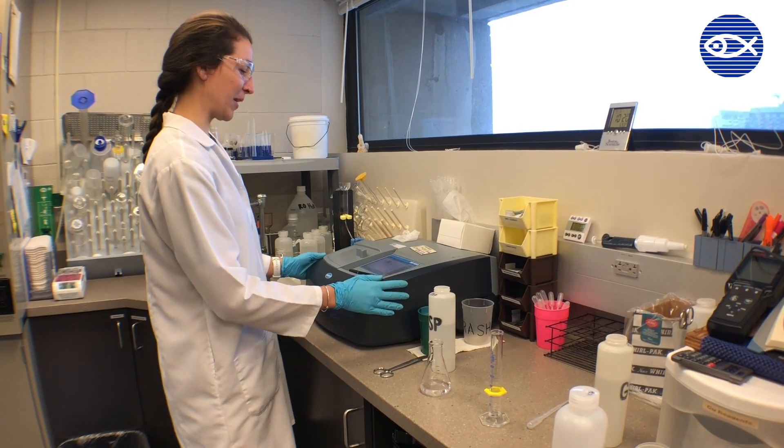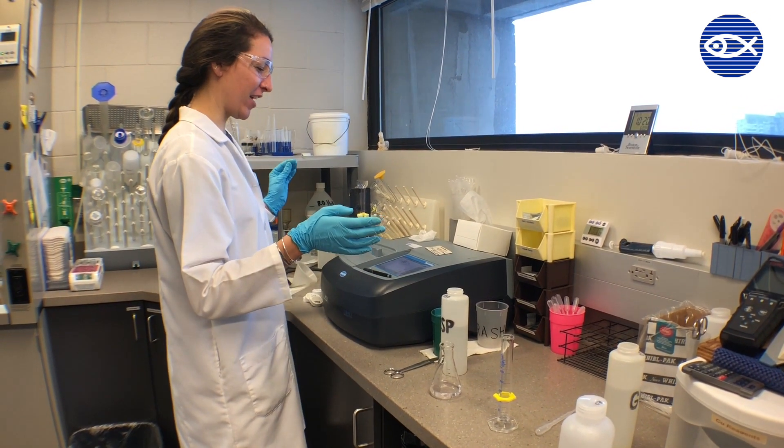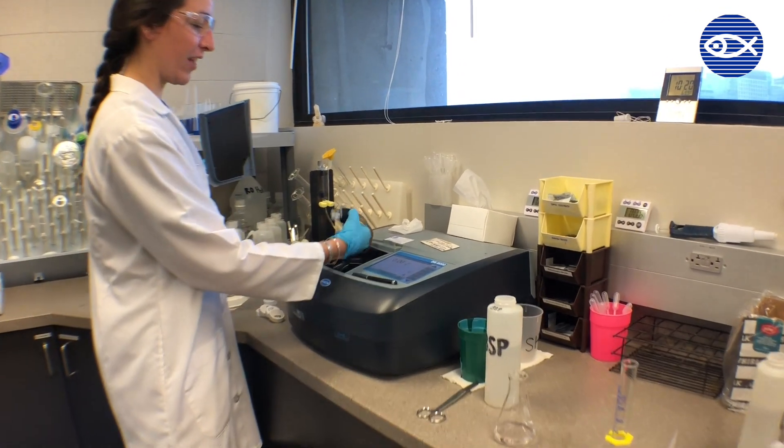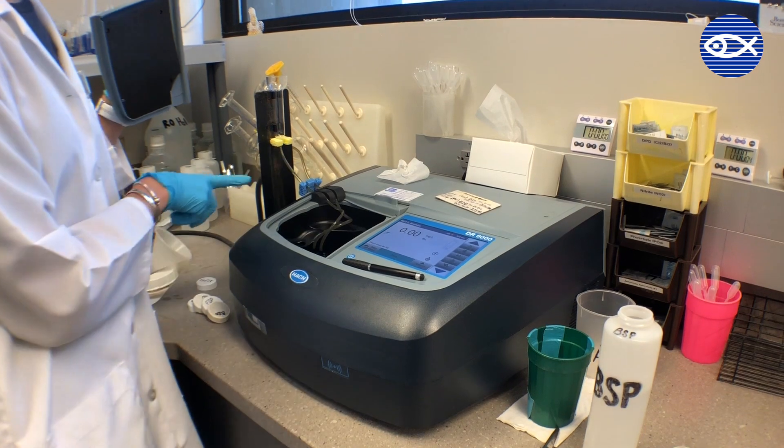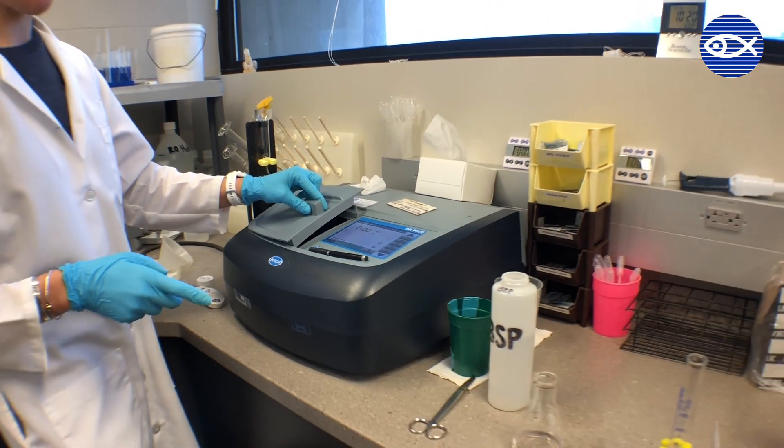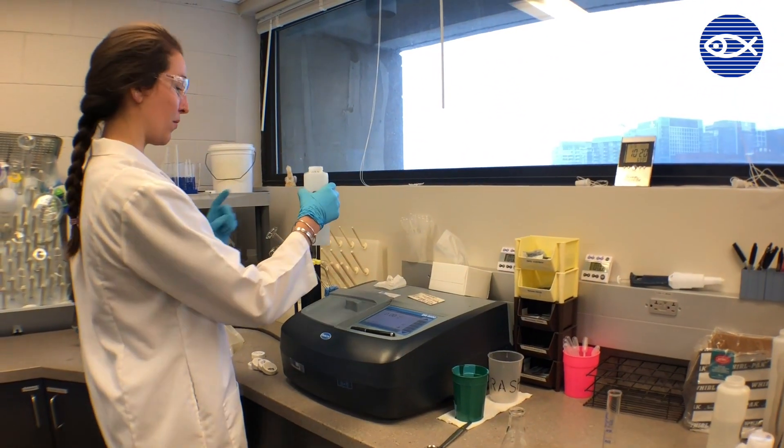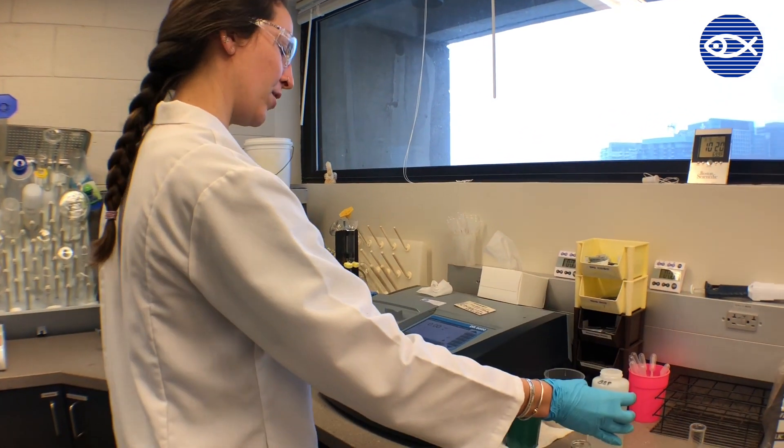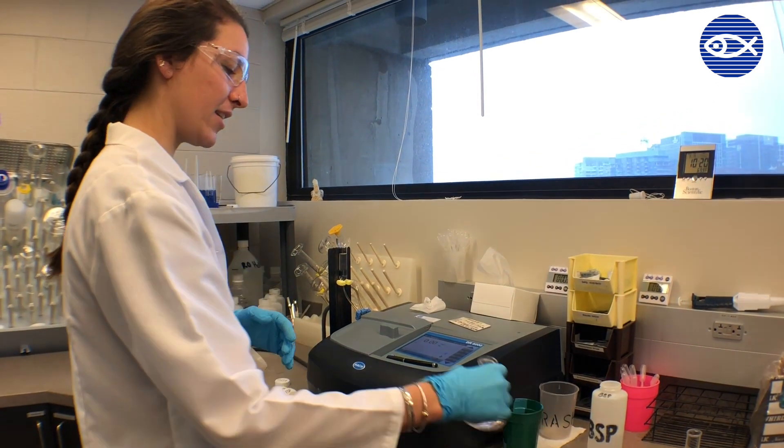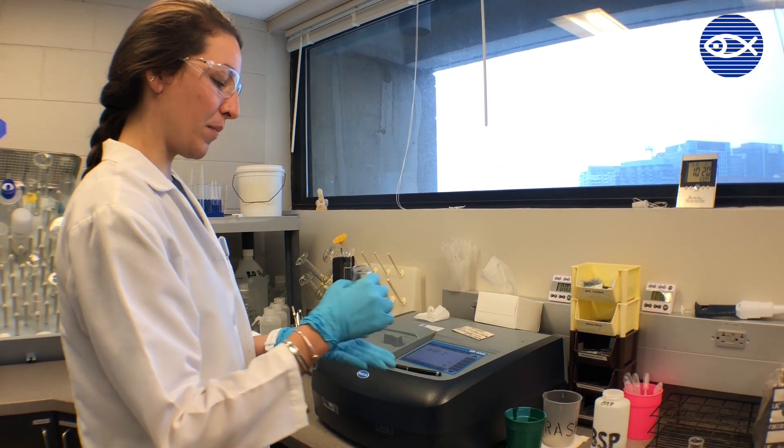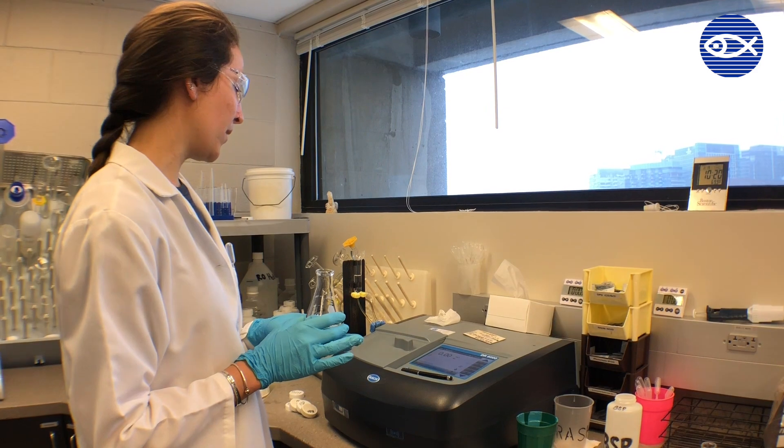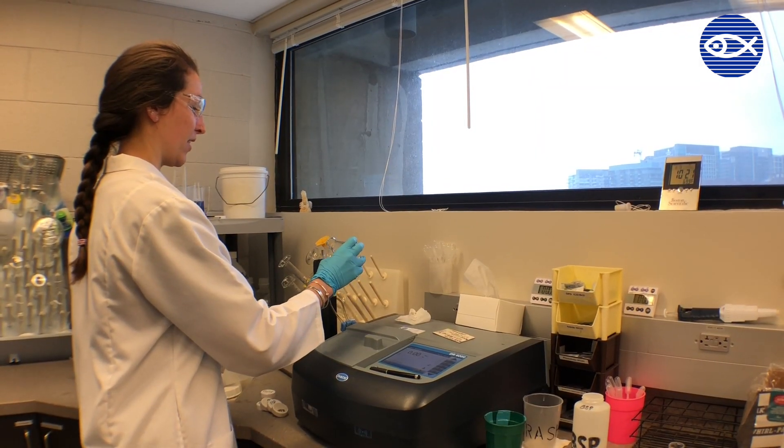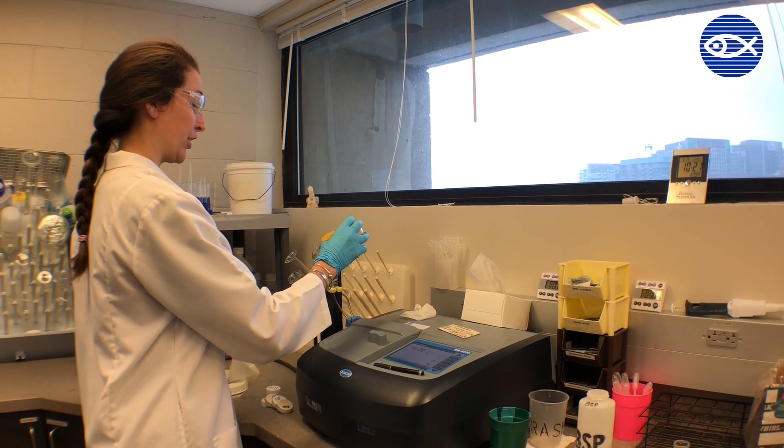This is our spectrophotometer. It runs all the tests that we need to run. Right now I'm using the pour-through cell, so in here there's a little cell that the water runs through and then there's a beam of light that shoots through it, and that's what does the measurement. So we'll use the regular water from the seal system and run it through, and that will be our zero. Then this is the sample water that I put the powder pillow in, the chemical to read it with. It should give us a rating of about 0.06-ish.